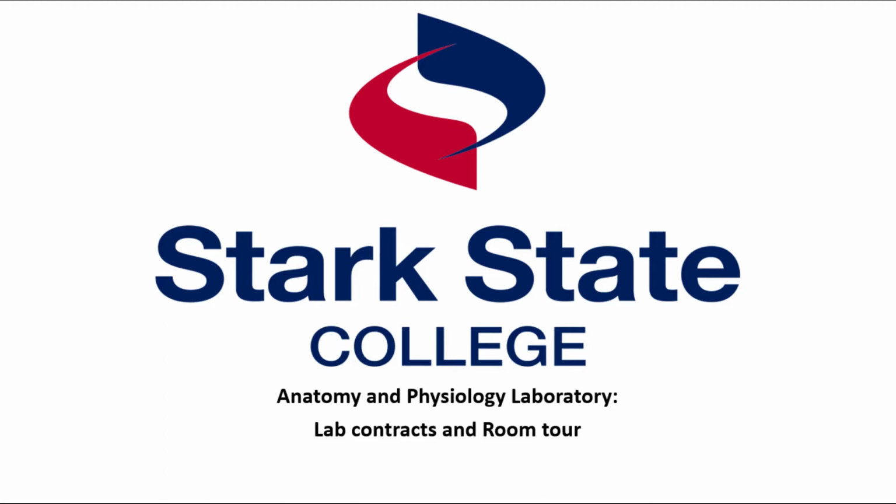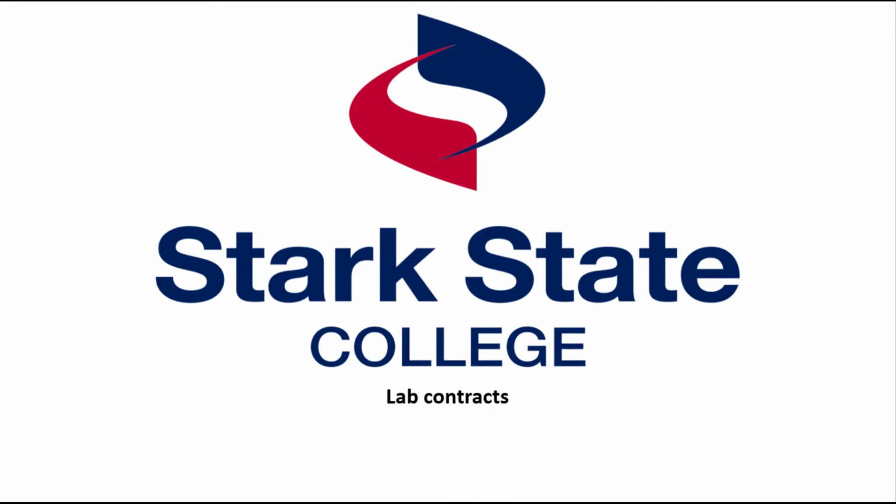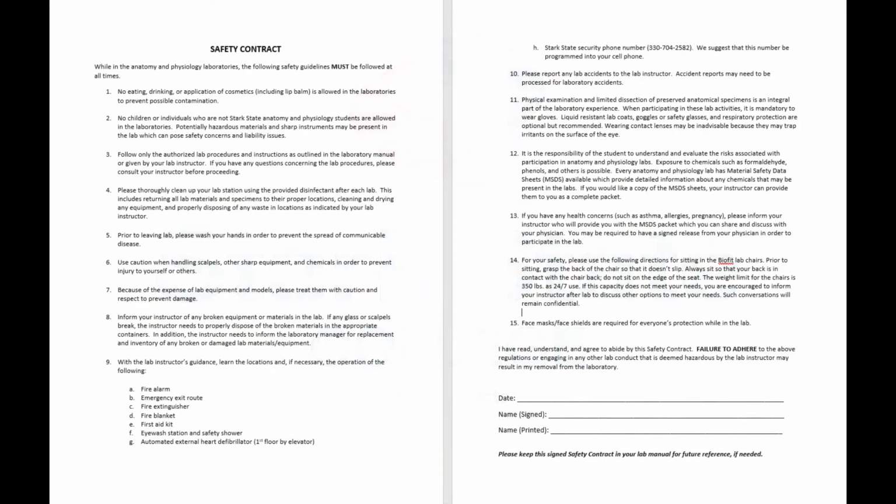In this video, we're going to be going over the lab safety contract for anatomy and physiology laboratories, as well as an overview of the laboratory space. Please note, the lab safety contract is also in your lab manual and will be posted on Blackboard. The safety contract. While in the anatomy and physiology laboratories, the following safety guidelines must be followed at all times.